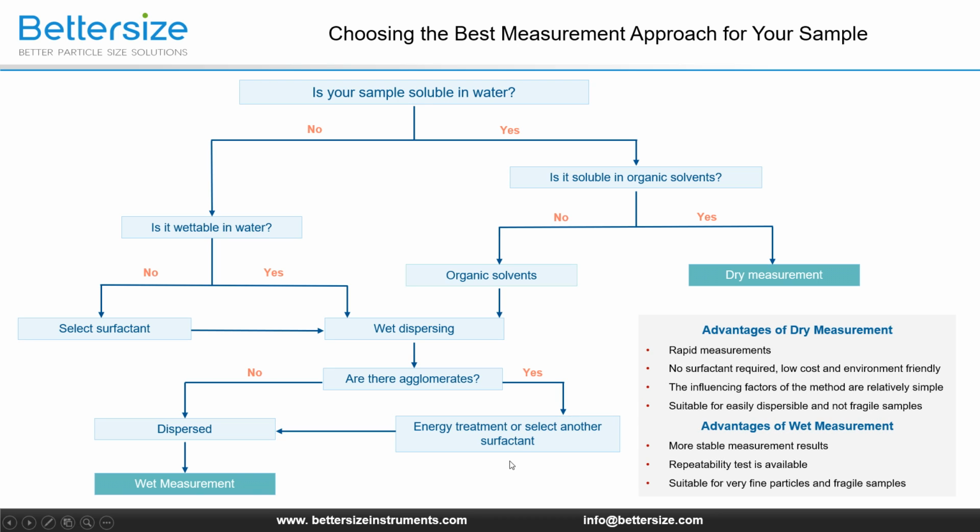The advantages of dry measurements include rapid operation, low cost, being environment-friendly, and so on, whereas those of wet measurements are stable results, available repeatability tests, etc. You are free to choose the method that has the advantages you value.